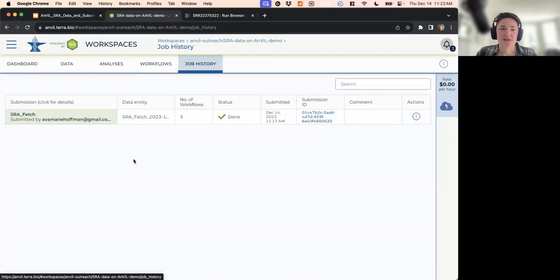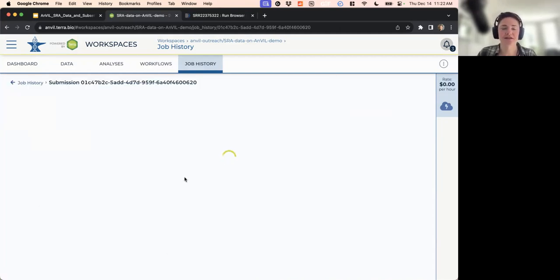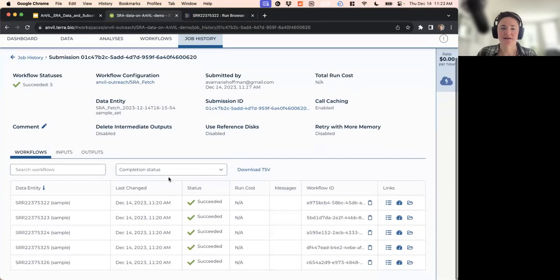All right. Well, fantastic. The workflow finished. Thanks for the questions to keep us busy there. If I go ahead and click on this, I can see that the samples were all brought in successfully, which is pretty cool. I won't get a run cost until, I believe, 24 hours later, but just to give you an idea, when I've run this before, the cost is literally less than 1 cent. And so we're dealing with micro cents here. So you'd have to bring in quite a few samples to get up into the dollar range.